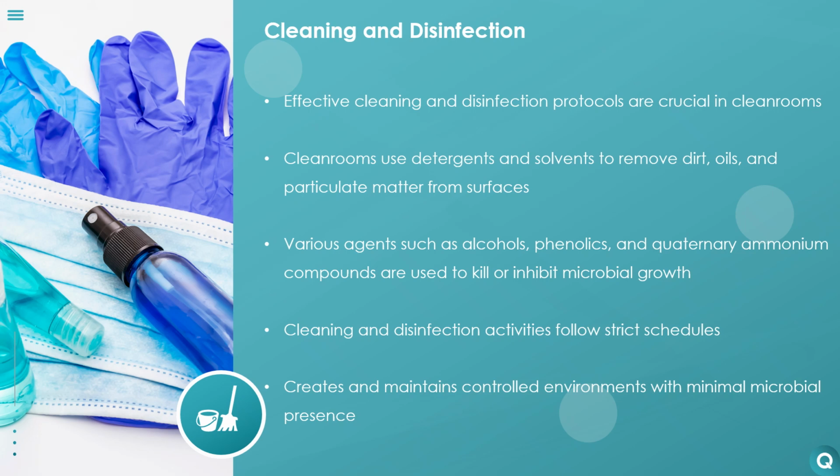The combined effort of cleaning and disinfection creates and sustains controlled environments with minimal microbial presence, crucial for sensitive manufacturing processes and research activities.